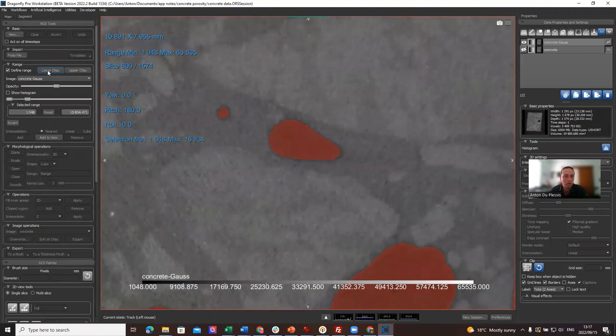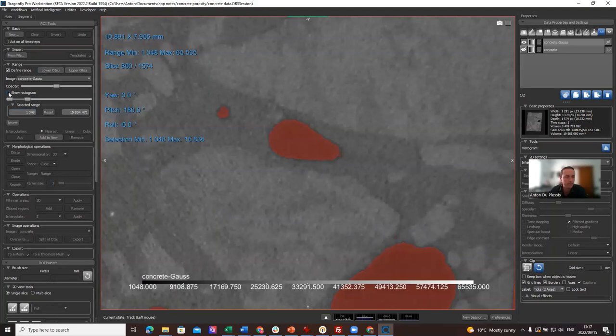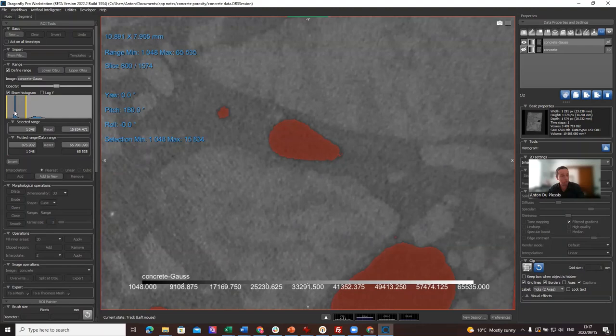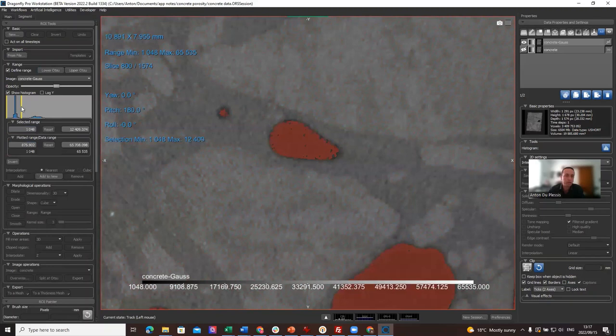OTSU is a thresholding method which is well established. It takes basically all the pixels with gray values in this range—in this case from 0 to 15,834—which is calculated automatically based on the data, based on the difference between pixels. So it works well with data with two material types, two main material peaks in the histogram. You can also manually drag that, of course, and change it if you want, but we're going to use the automated one, which is the Lower OTSU, and add it to new.